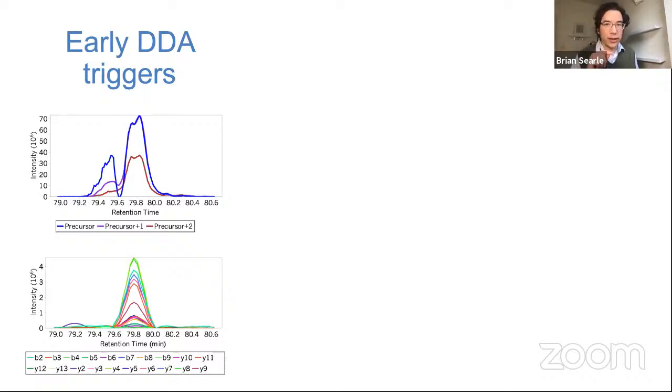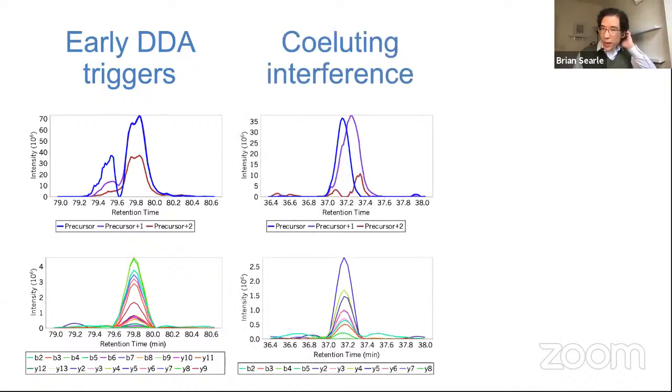And we can see that there is another peptide that comes out just a hair later, about half a minute later, with great MS2s associated with it. But we would never measure this with DDA because we would have put that peptide on a dynamic exclusion list. Another aspect is that with DDA, the precursor signals can be very complicated. They can have a lot of interference because it's only 3 measurements that we're able to make.